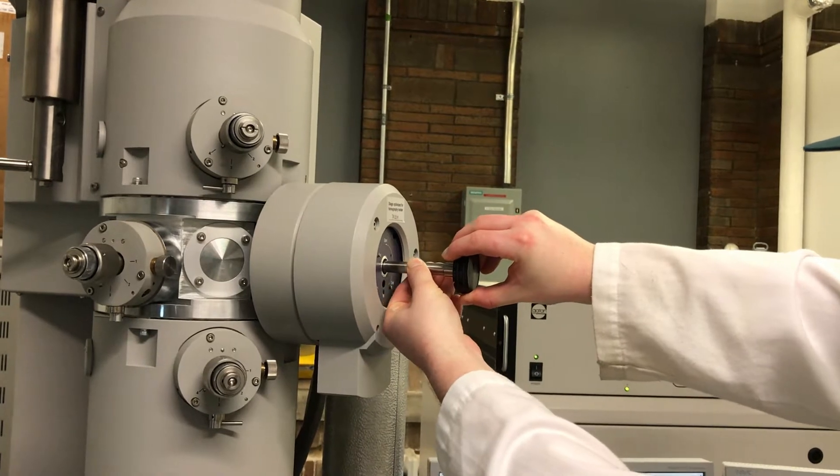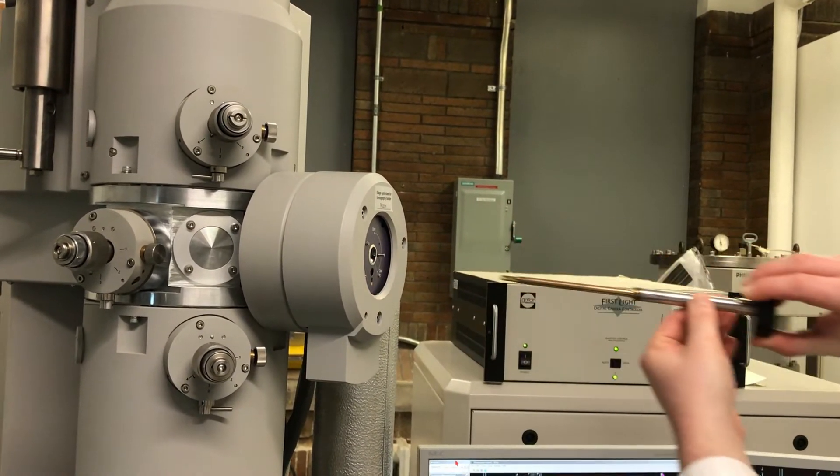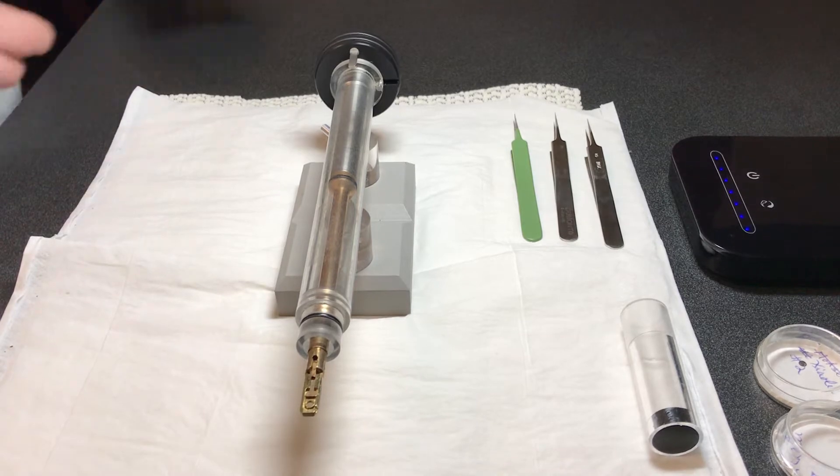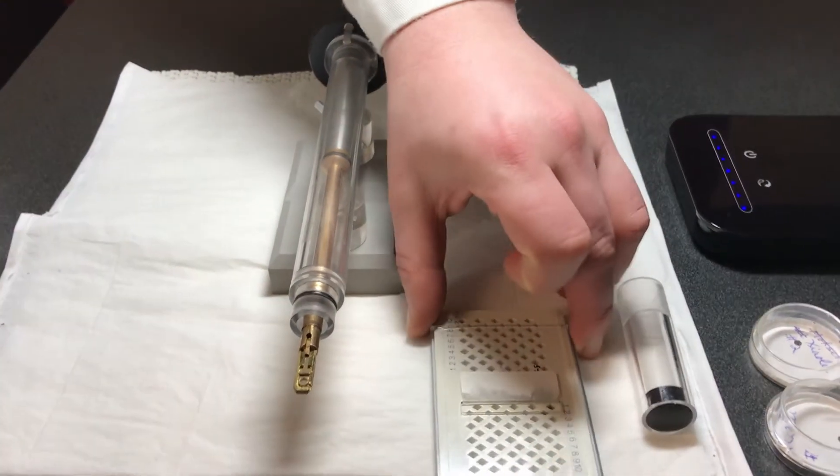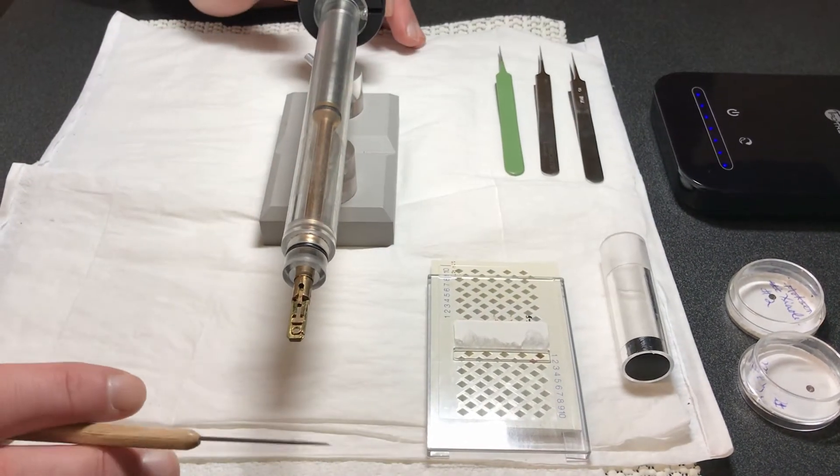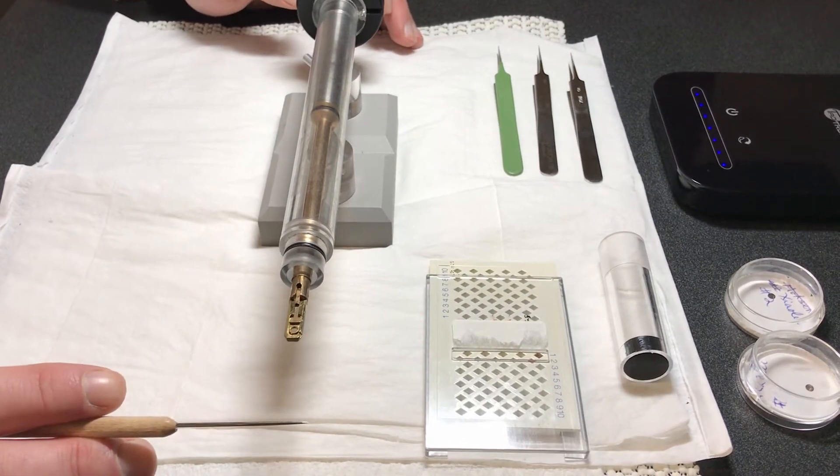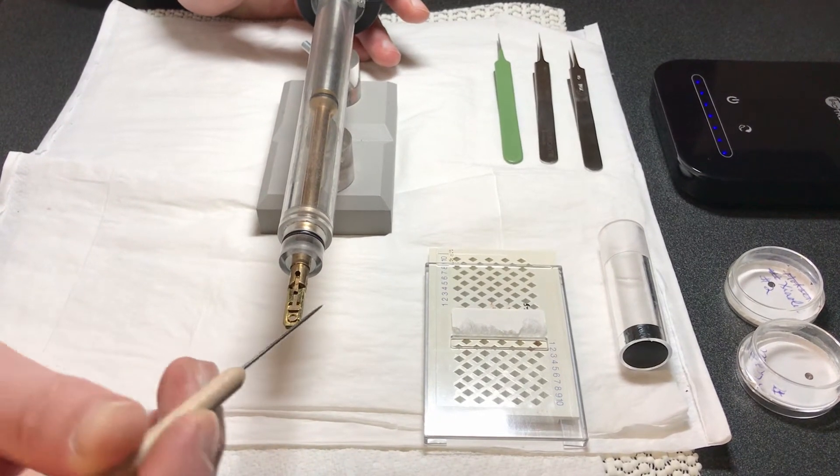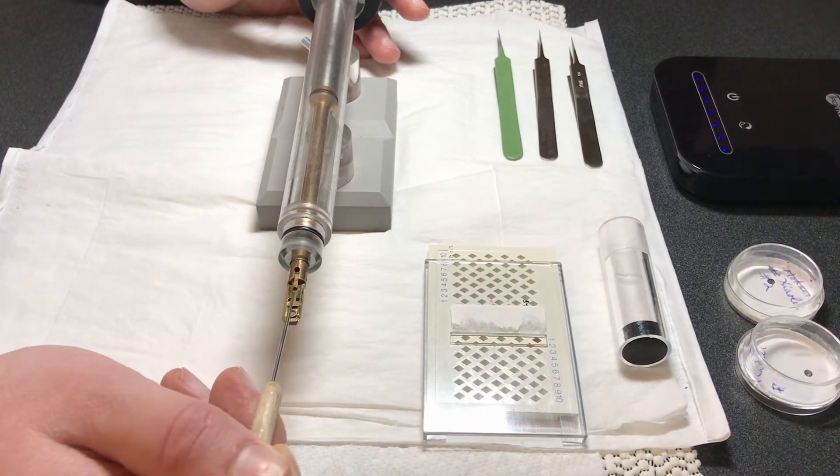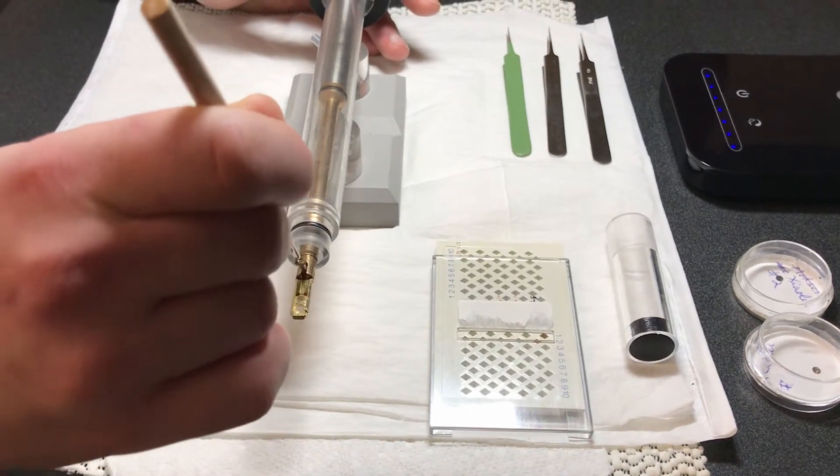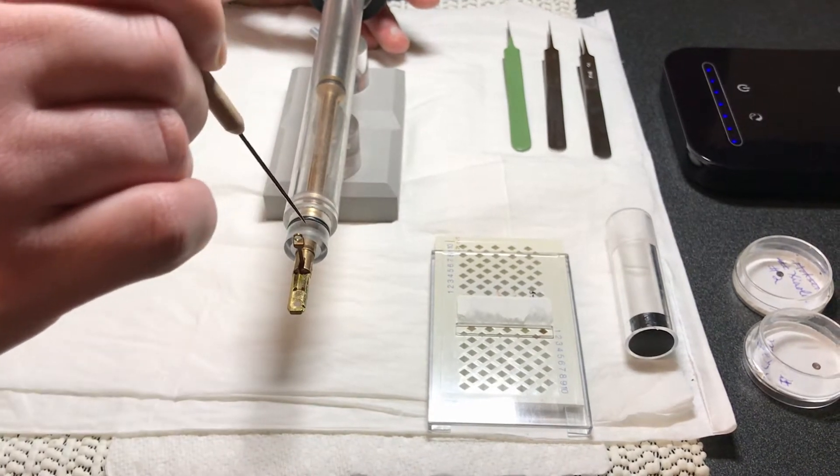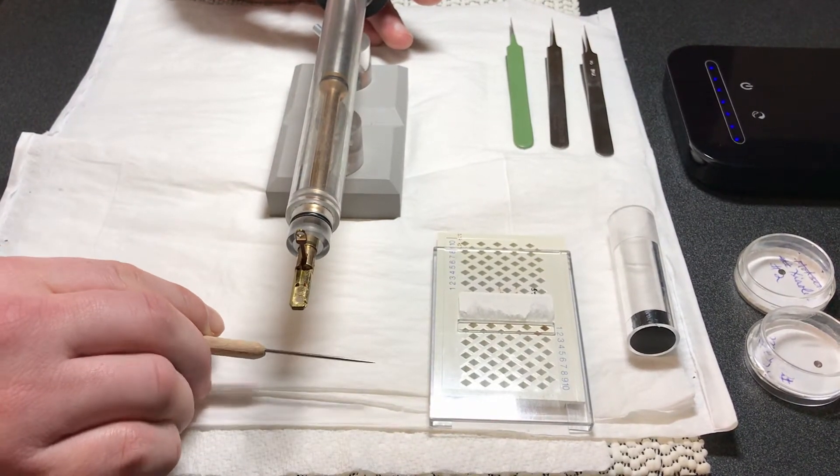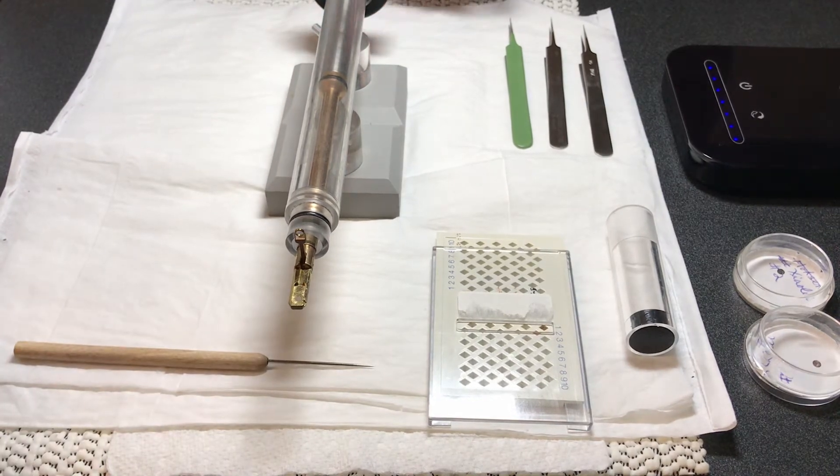Next we place the holder into the sample loading tool. It's important to remember that we never touch the room temperature holder below the black o-ring, as it can introduce dirt into the column and affect the vacuum in the microscope. Now we are loading a grid onto the room temperature holder using the sample loading tool, which is the pointy thing in the video.